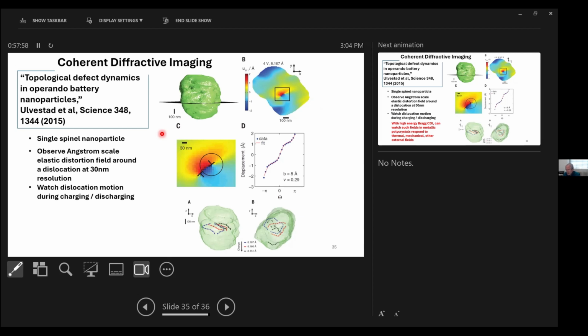One of the things that I've been playing with in my spare time, again in my retirement, is looking at some near field data that we took. So near field, using the near field geometry with a detector up close with a high resolution detector.